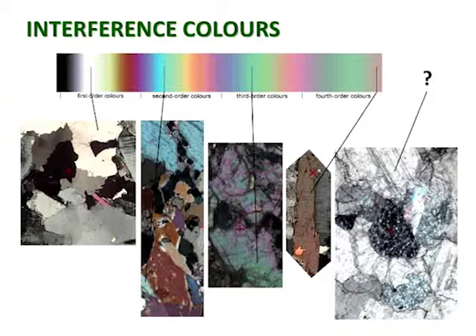And here those interference colours are a mix of pinkish at the bottom and more greenish, or a mixture of green and pink as you go further up the crystal, which probably means that the crystal in the thin section is getting thicker as you run from the bottom to the top. So that places it somewhere up at the top of the third order.